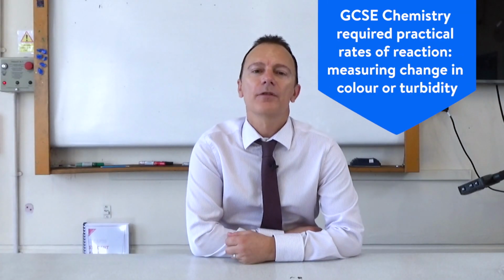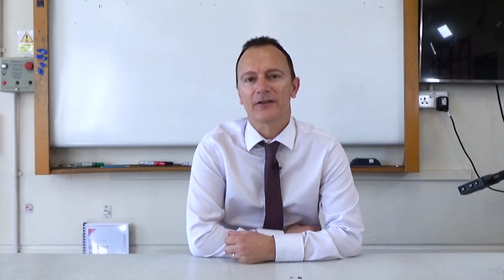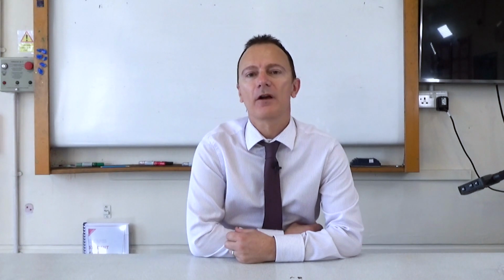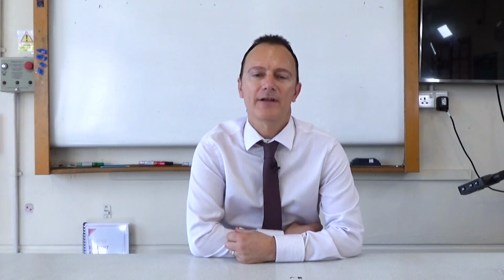Welcome to our video that will show you how to set up and carry out the GCSE Chemistry required practical on rates of reaction. There's actually two required practicals on the rates of reaction topic, and in this video we're going to be showing you how changes in turbidity can be used to measure the rate of reaction.